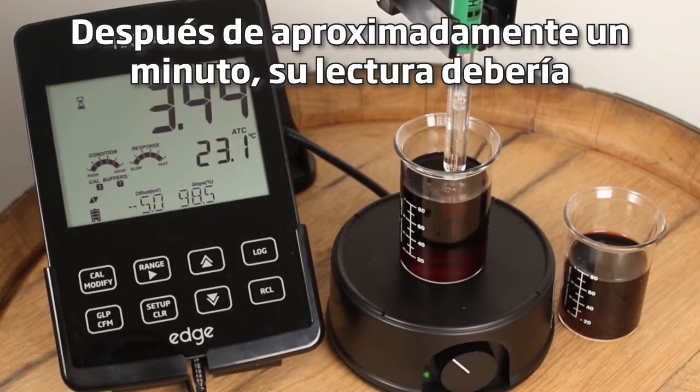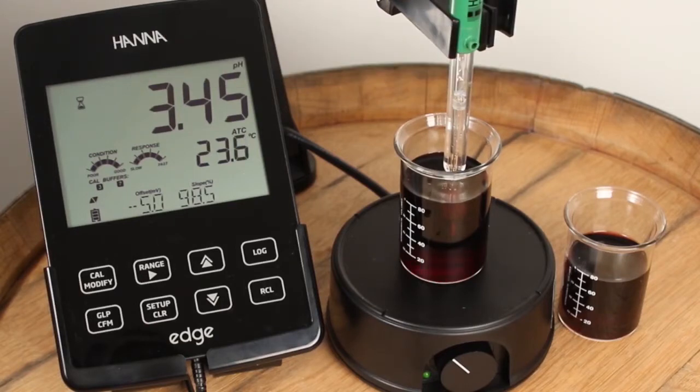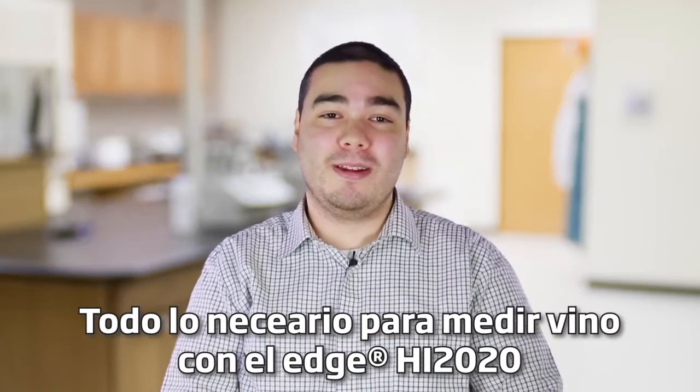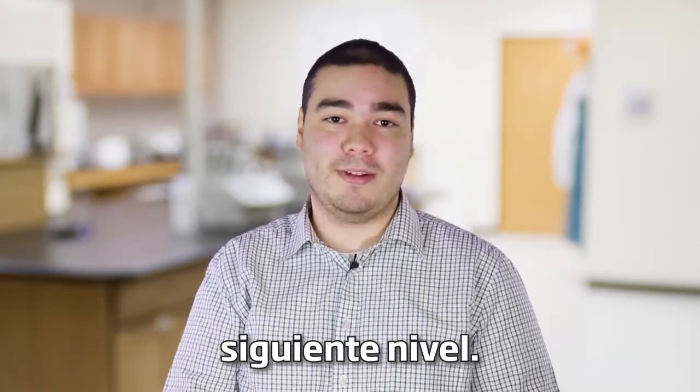After about a minute your reading should stabilize and you will have your correct pH reading. The Hanna HI 2020W wine kit is the right solution for winemakers looking to take their wine analysis to the next level.